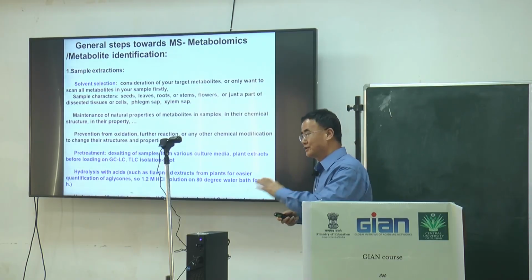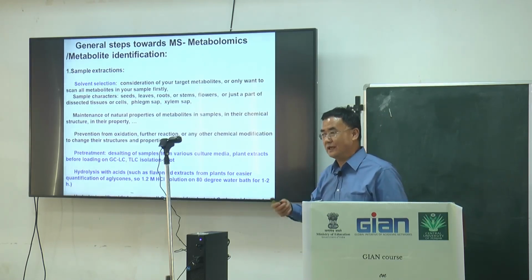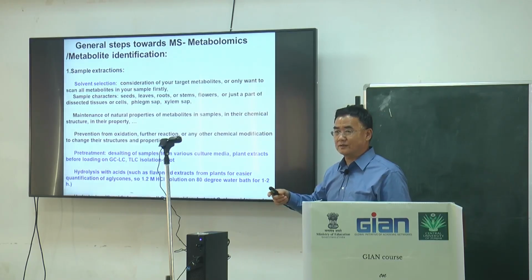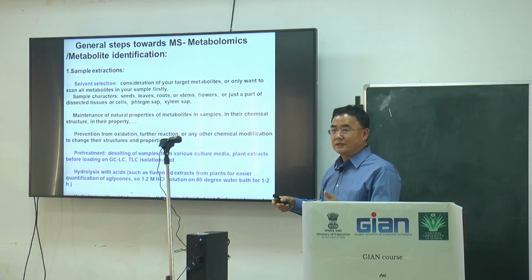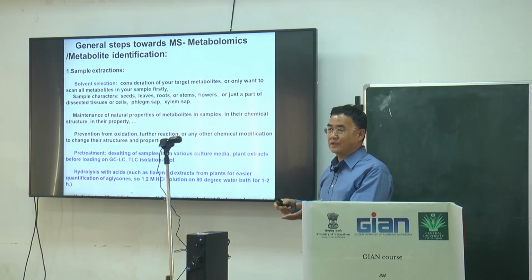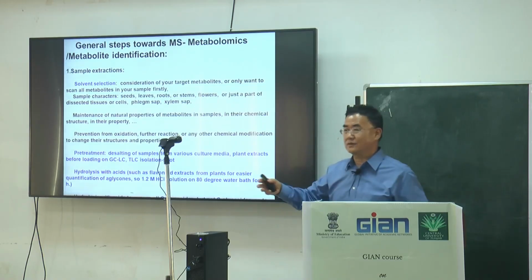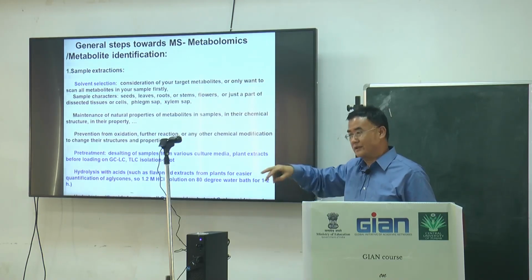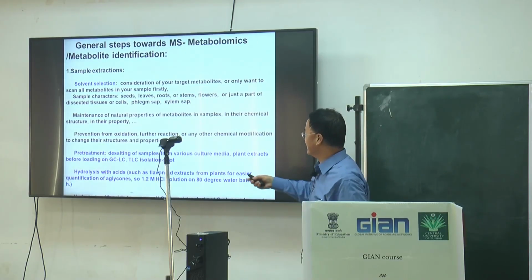For plants that contain high amounts of polyphenol or phenolic compounds, you have to add some anti-oxidant, or some polymer like PVP. That's very common. Even when we extract RNA from those samples, with kits that's fine, because the kits already contain those compounds. But if you do it by yourself, you have to consider it in RNA extraction.